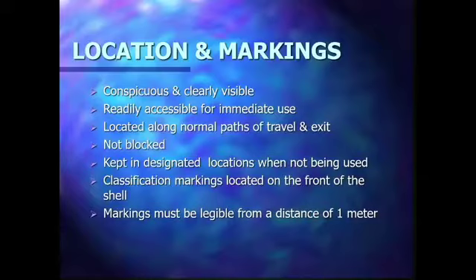Location and markings. This is very, very significant. During an emergency, we must not be in a situation where we need to find where the fire extinguishers are. That is the reason why location and markings are the primary requirement for us to set up in all facilities. It should be conspicuous and clearly visible.